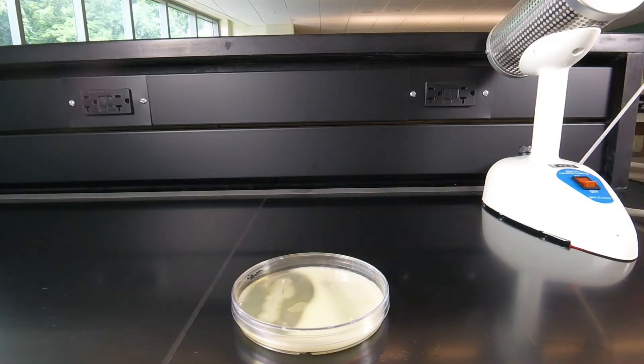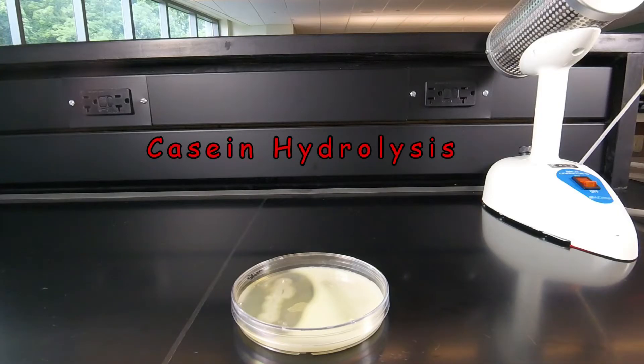One of the exercises in today's lab is looking at protein hydrolysis by bacterial enzymes. In this case, we're going to look for hydrolysis of a protein called casein, which is the principal protein found in milk.